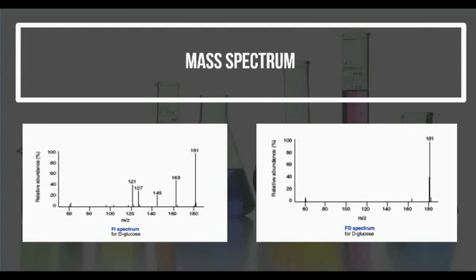From these two diagrams, we can see the sample of using D-glucose to show the difference in fragmentation between field ionization and field desorption. It can be observed in the field ionization spectrum that there are 5 fragmentations of different sizes, while in the field desorption spectrum, only 1 visible fragmentation was observed.